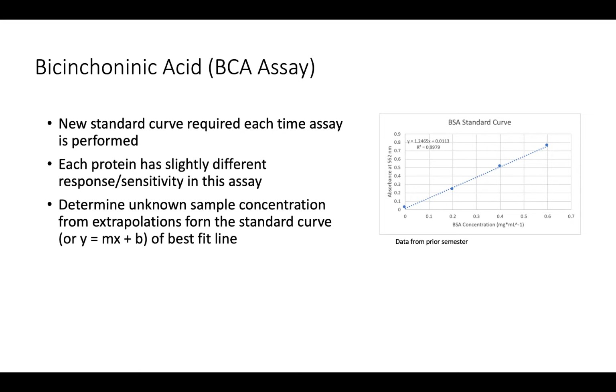So get everything prepped, and it is your last aliquot where you're putting your last ingredient into your cuvette. The time from when you put it in there to getting it into the spectrometer to measure is extremely critical so you can get that initial rate.